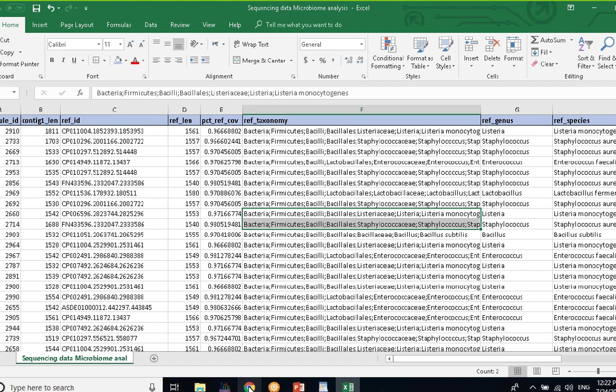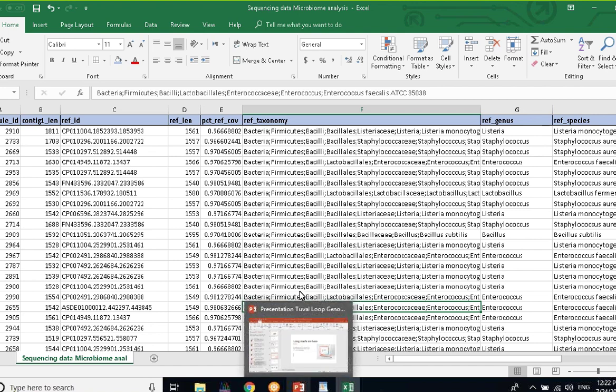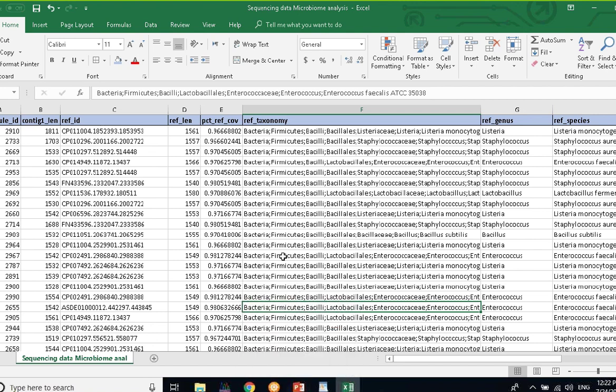Okay, so that was a partial summary of what our output looks like. If any of you are interested in taking a look at what a full output folder would look like with all the different data outputs, shoot us an email and we can send you example data for that. As I mentioned before, you can download from our website example FASTQ files and CSV files like this for the synthetic communities from Zymo Research and ATCC. And if you're interested in the other downstream analyses that we're doing, such as the different visualizations that we're providing, shoot us an email and we'll send you example data.